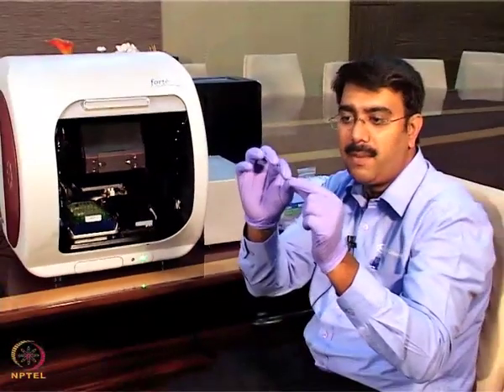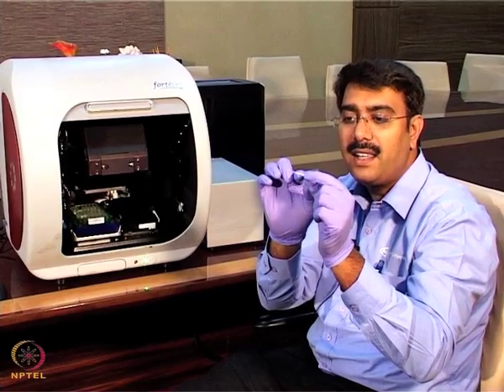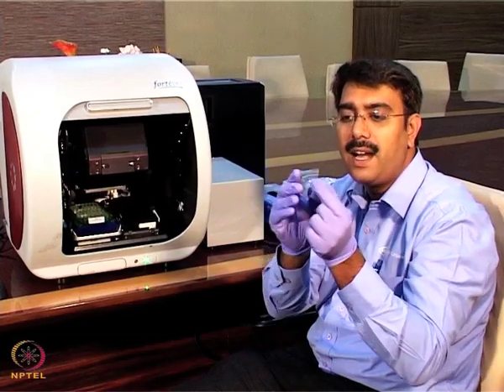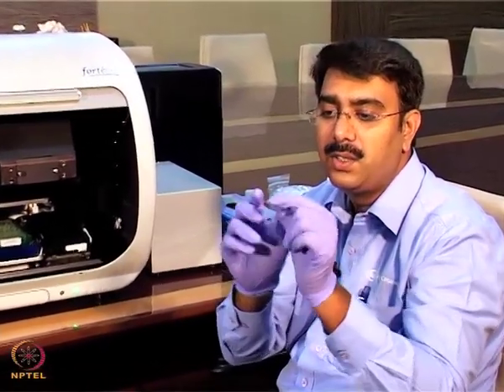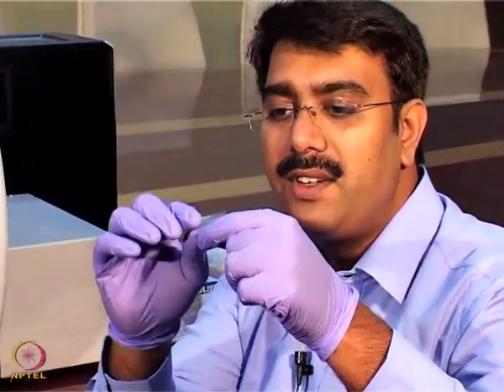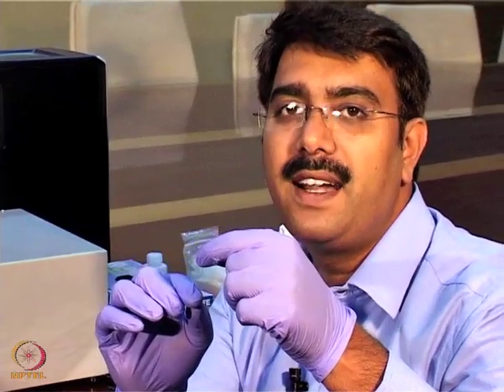It is actually made up of glass. It consists of a fiber optic inside, and the end at the holder part is made up of plastic. So inside there is a fiber optic. At the tip of the sensor, we put the ligand of our interest. We pass a white light and the light gets reflected back. It is a reflection-based phenomenon. One light comes from the internal optical layer, and another light comes from the ligand end.